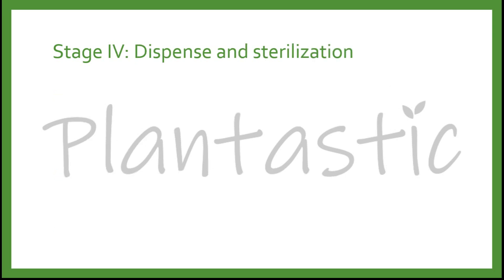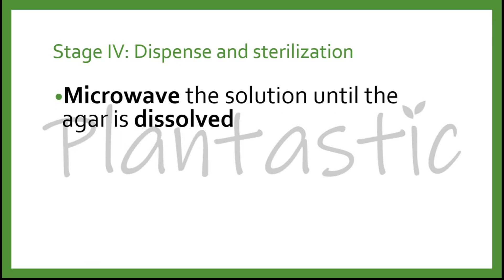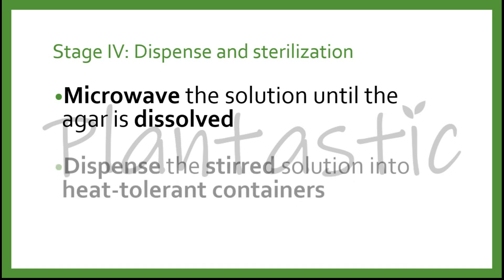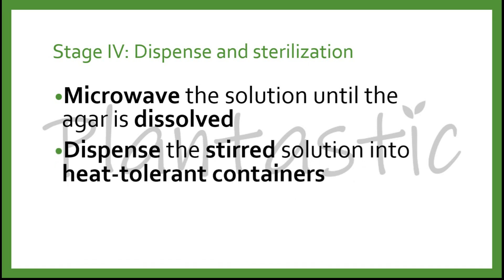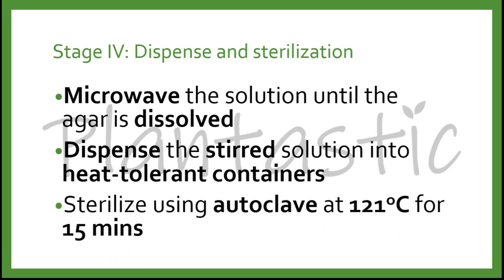The last step: we microwave the solution until the agar is dissolved and boiling. We then dispense the stirred solution into heat-tolerant containers and close them with heat-tolerant lids. After that, we sterilize them using autoclave at 121 degrees Celsius for 15 minutes.